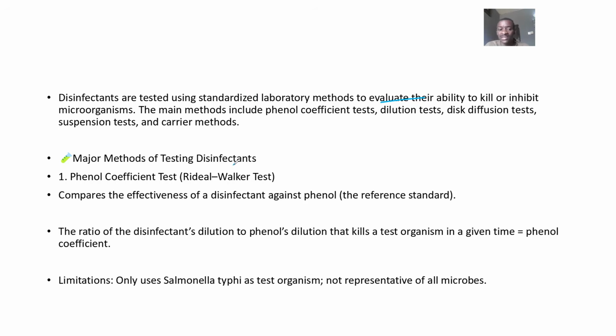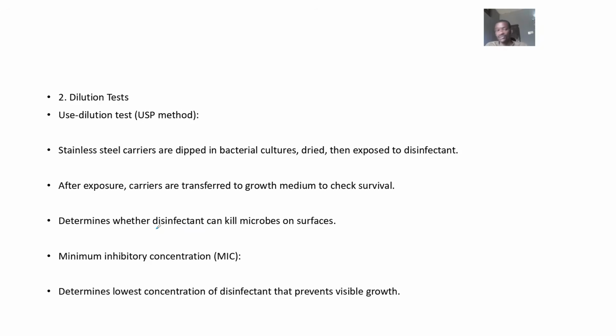So the first one is known as the Phenol coefficient test, also known as the Rideal Walker test. It compares the effectiveness of a disinfectant to phenol, which is a reference standard. So the ratio of the disinfectant dilution to phenol dilution that is able to kill a microorganism is what is known as the Phenol coefficient. So they compared the effect of a microbial agent to phenol. All right.